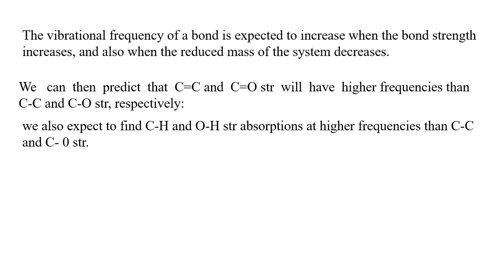Okay, I think you might have got a clear idea about the basic principles underlying infrared spectroscopy. In the next or upcoming videos, I will discuss the factors influencing the vibrational frequencies and the applications of infrared spectra in the determination of structure of organic molecules.